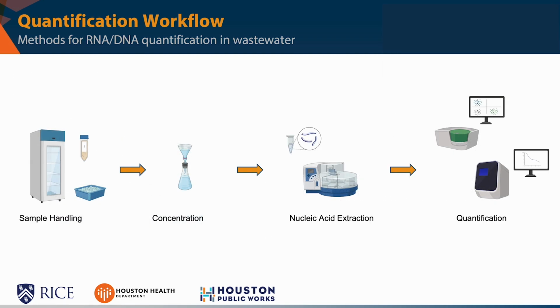Although various methods can be used for sample processing, the following is a standard workflow implemented in our lab and others when determining concentrations of microbial targets in wastewater. This workflow includes measures for proper handling of wastewater samples, concentration, nucleic acid extraction, and quantification. In the next few slides, I'm going to briefly discuss the purpose of each stage, different methods that are commonly used to carry out each step, and things to consider when choosing a method.